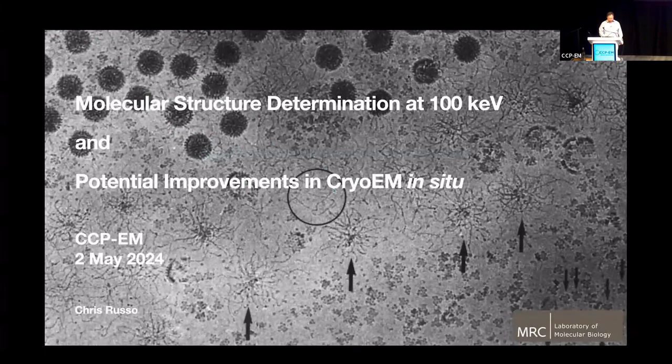And if you look at this micrograph carefully, you can see the potential of the field once you could prepare these specimens in a reasonable way, vitrify them, and have coherent electron sources that were good enough to actually image secondary and tertiary structural features. You could see the viruses. You could see as the ice gets thinner, the material inside the virus got splayed out on the air-water interface. You could see the individual assemblies, these little bits of 9 subunits put together, and then even the individual subunits.